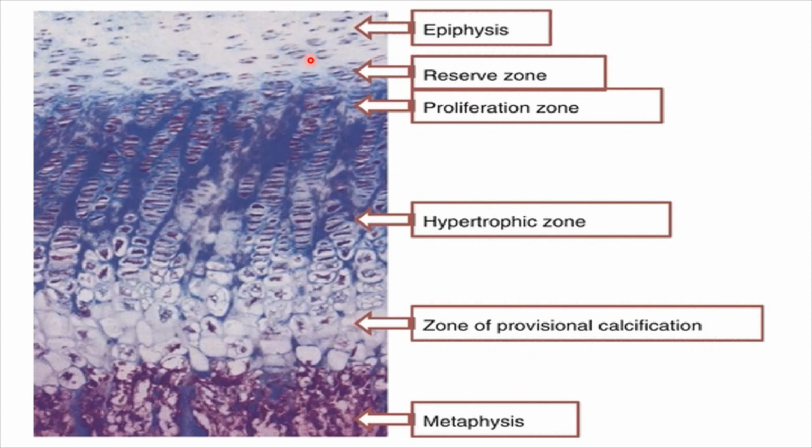All right. So what you also have to know is that in the diaphysis, there is a region of primary ossification. What that means is that that is the first place in the bone where cartilage is turned into bone. And then the epiphysis has secondary ossification centers, and it takes a long time for it to totally ossify. That's why for the bones to be totally ossified and for you to stop growing takes an average of 21 years in the human being. All right, so that is the slide that you're going to draw for the epiphyseal plate.